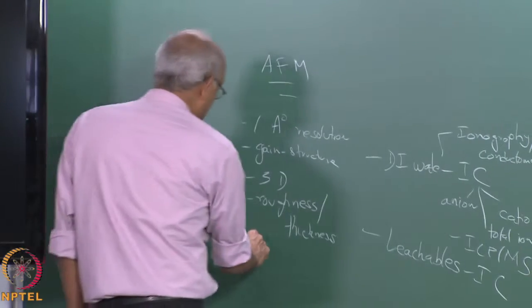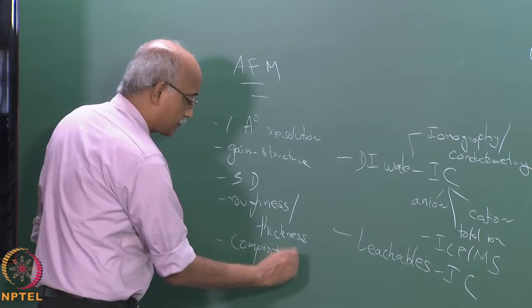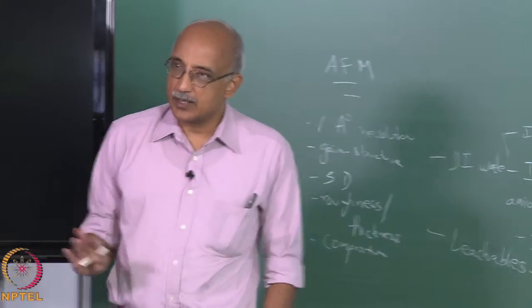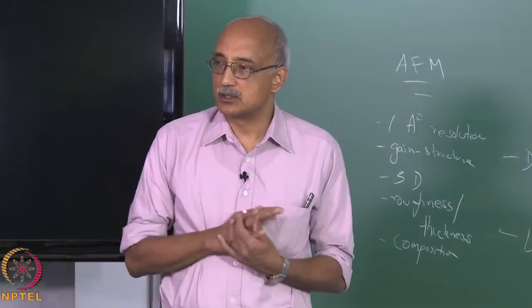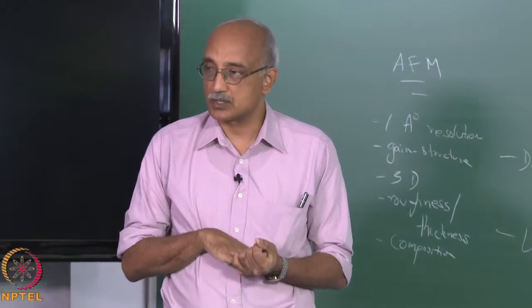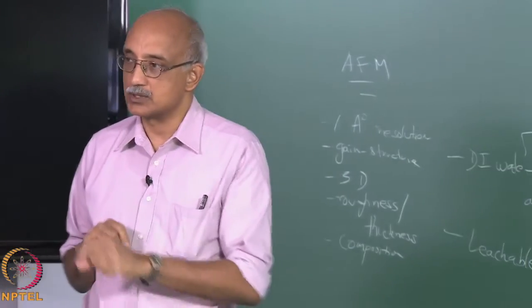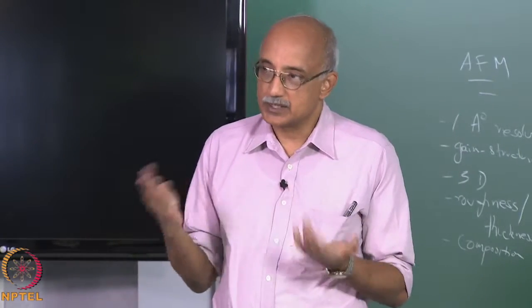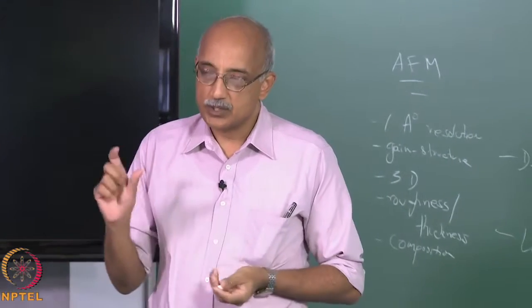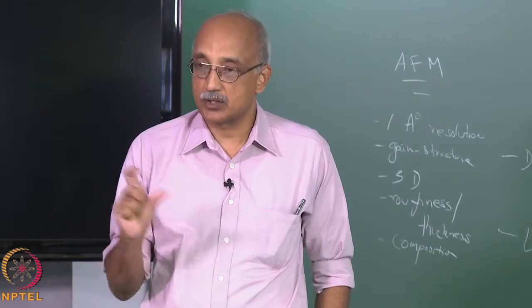AFM can also be used for composition analysis. Can you guess why an AFM would also give you composition analysis information? The reason is that the AFM is essentially measuring the force of attraction between the surface and a very small probe that gets close to the surface. And I mentioned that this is basically a van der Waals force. But the van der Waals force itself is determined by the materials that are in contact.